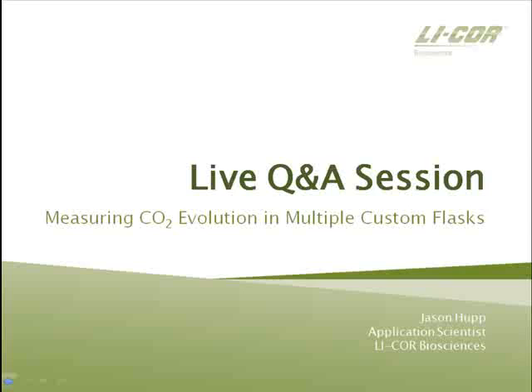All right, thanks, Jason. So how important is measuring the temperature in the chamber? Well, as I said earlier in the presentation, the effect of temperature on the measurement is fairly small. For the same dC/dt, changing temperature 20 degrees Celsius only changes the flux by 6 or 7%. If you don't measure chamber air temperature using this system, the chamber temperature defaults to the temperature of a reference junction inside the instrument. So if the temperature differential between your chamber and the instrument is small, the effect on the flux is going to be relatively small. However, if you're expecting large temperature differentials, like you want to make measurements far away from ambient or whatever conditions the instrument's going to be housed under, it becomes much more important to measure temperature in these conditions. And the thing to do there is just to measure it and recompute the fluxes after the fact using the correct temperature.